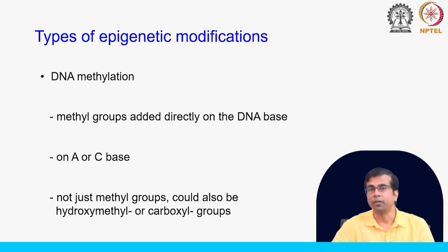So, we will talk about this again in the next class, where we will discuss how we can identify these modifications if we are using the Illumina platform, or how we can identify them if we go through the nanopore or the SMRT platform.